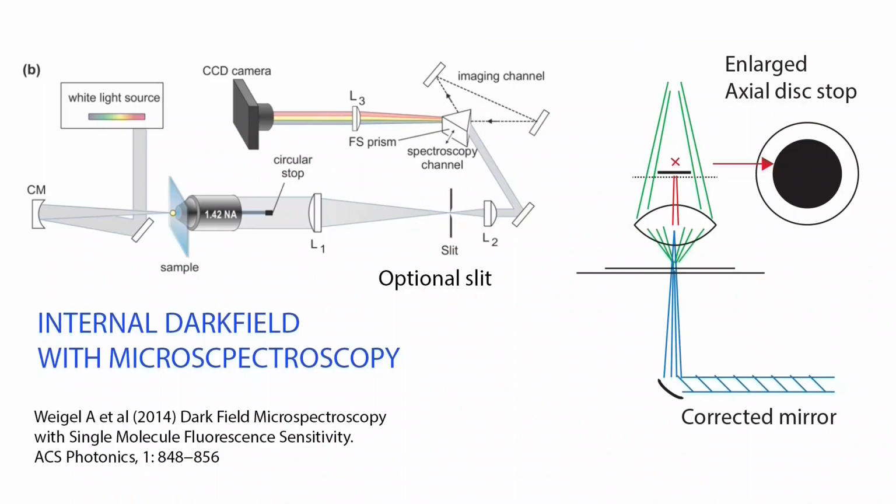A method of Weigel et al. uses a narrow axial dark field illumination beam coupled to an unusually wide axial Fourier stop that acts as a high-pass filter to block most of the low-frequency image components along with nearly all the diffuse scattered background light.